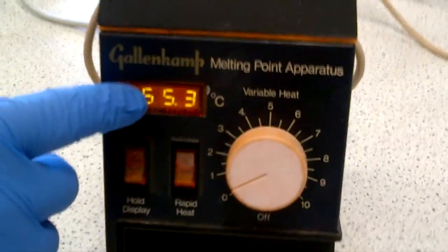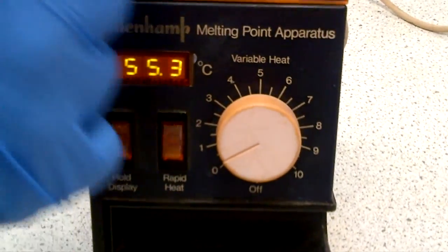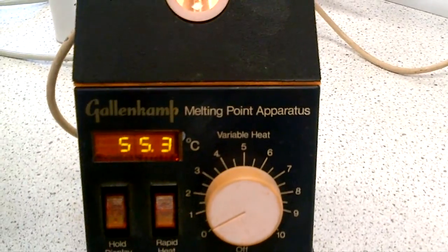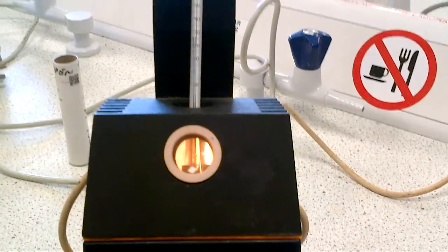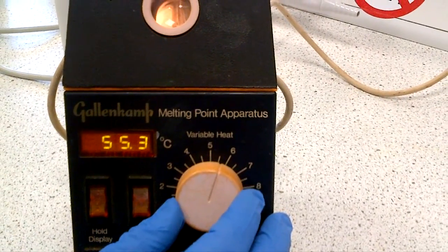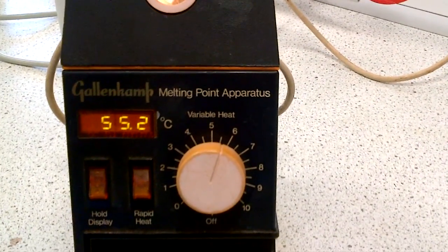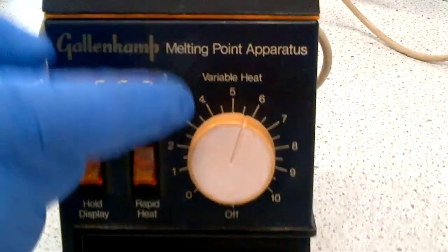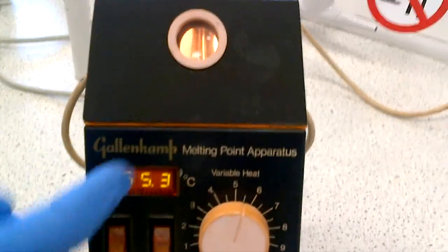And because we're now heating, this says 55.3 degrees C, and on my thermometer I'm up to 55. What I am going to do is to put it on to 5 to 6 quickly, and we need to get it to about 150, 160.